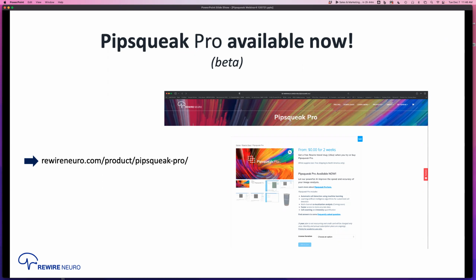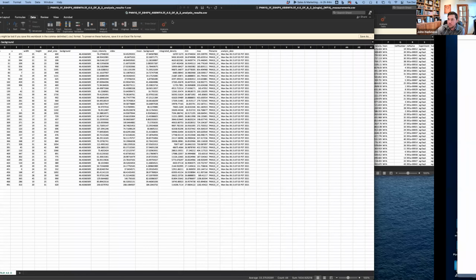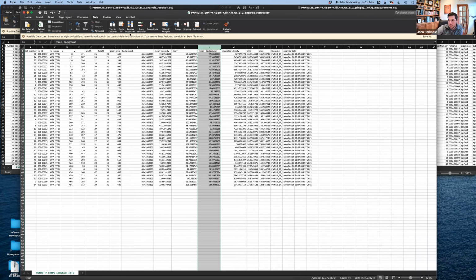Yes, I was interested. What can be data output? Great question. I didn't spend too much time on it here because we have talked about it a little bit in one of the other webinars. What you're going to see is going to become more and more usable in Pipsqueak Pro.